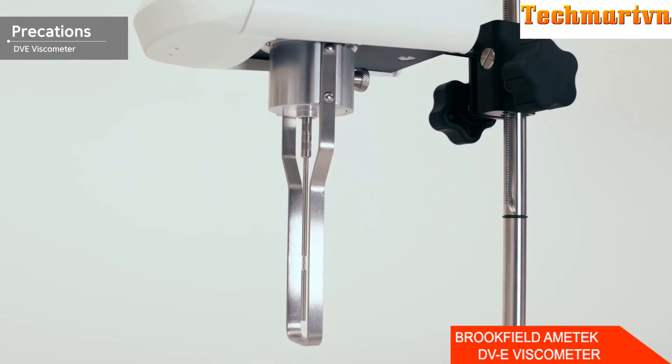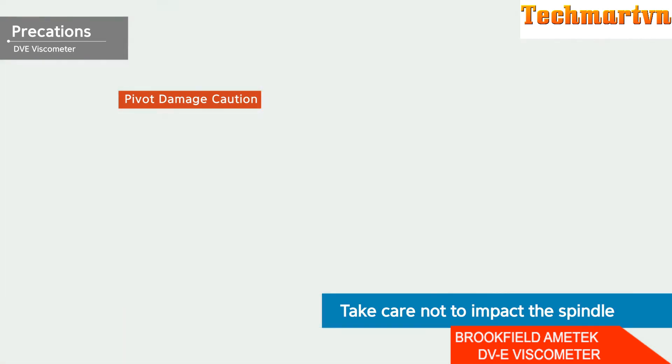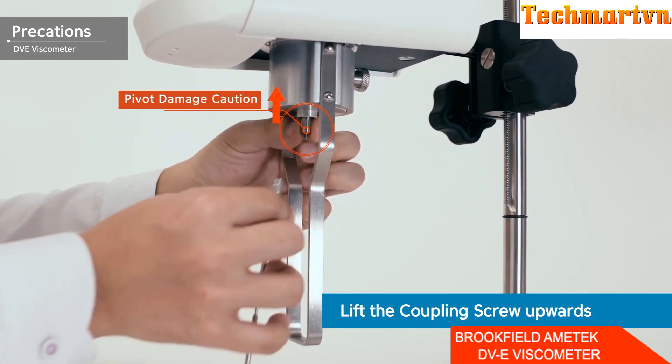Be careful not to shock the spindle while it is engaged, as the pivot is more likely to be damaged if the spindle is impacted. When connecting or removing the spindle, always hold the coupling screw upwards to prevent damage to the pivot.